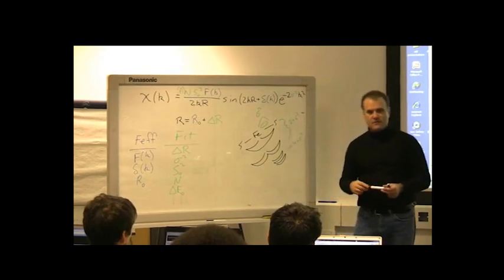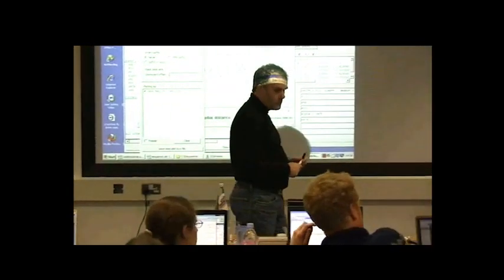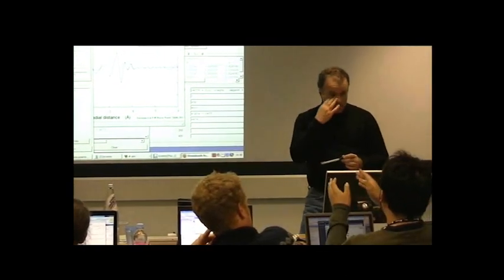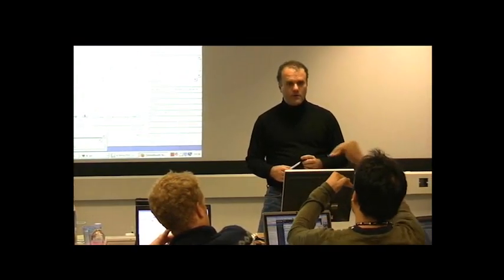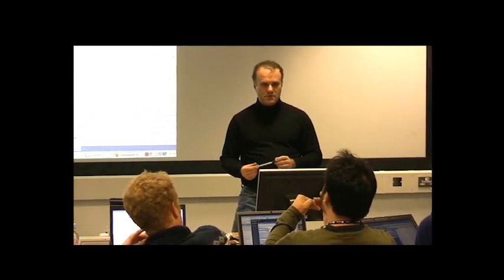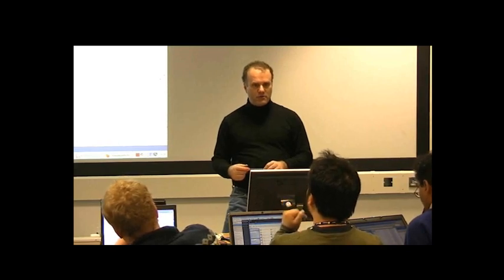Just the range of R that we include in the fit when we stack the spectrum to see that shell actually involved in the spectra, and then we shoot to fit, and it's not actually covering the tail. So I saw you select the 4.2 instead of 4.5 that covers all the tails of that spectrum. That would actually probably be better.